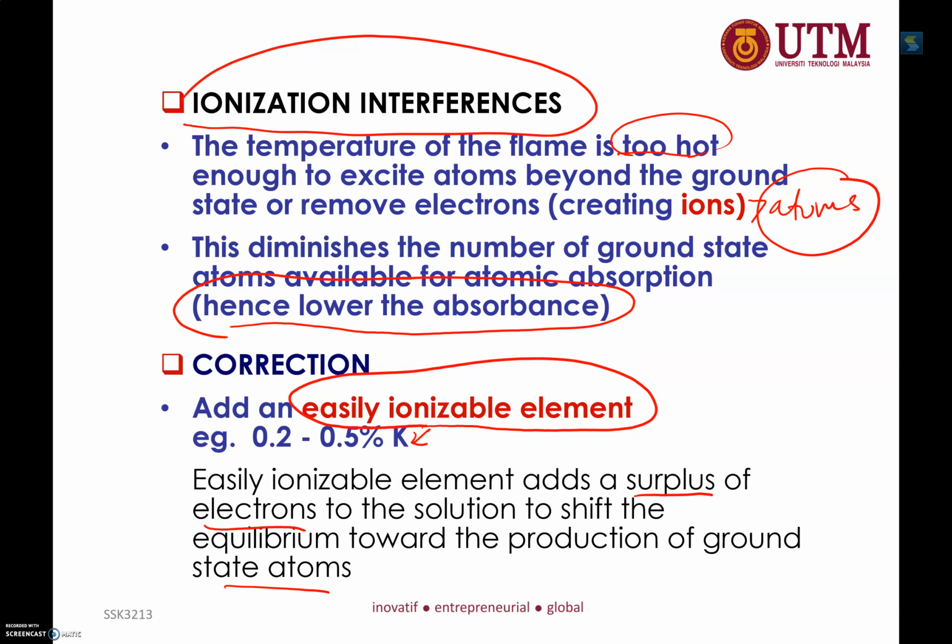So that's all for atomic absorption spectroscopy. We will move forward to sample preparation, sample preparation that is suitable for atomic absorption spectroscopy.